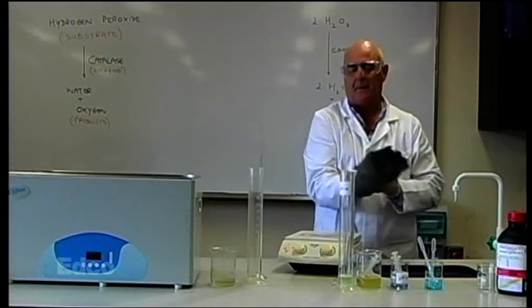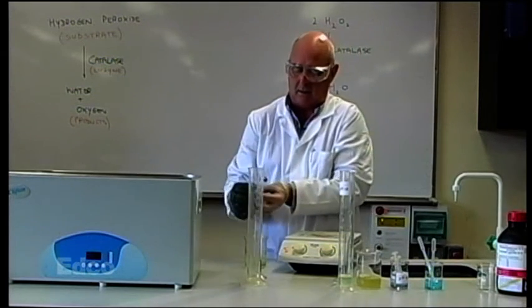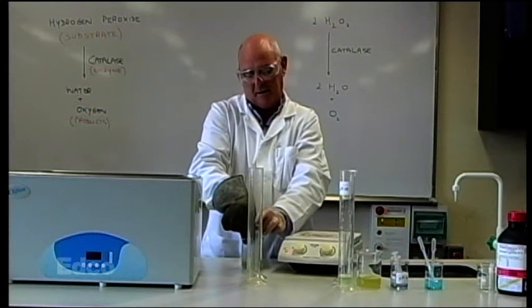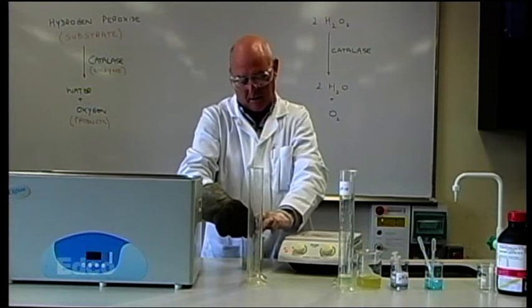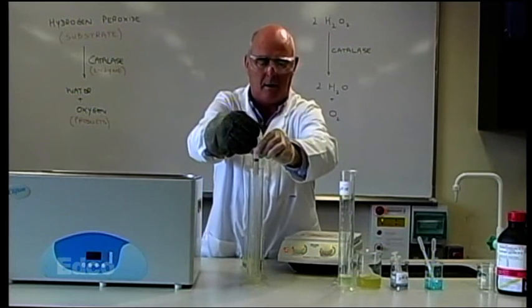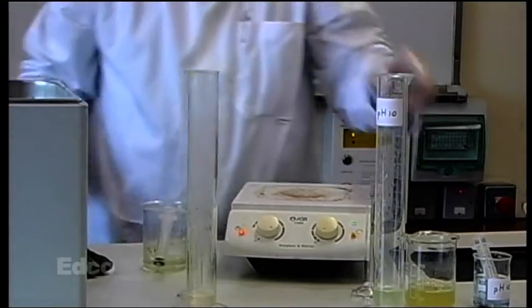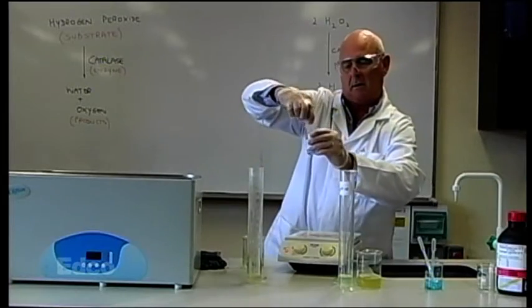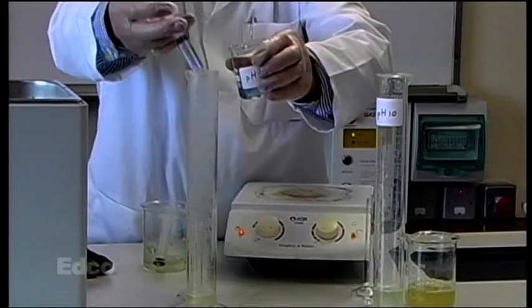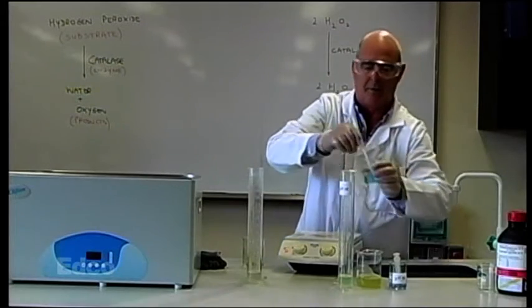On the other side, we take 10 cubic centimeters of the boiled enzyme. We take 10 cubic centimeters of the pH buffer 10. And again, 2 drops of washing up liquid.